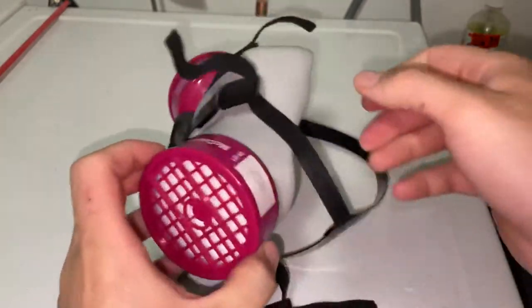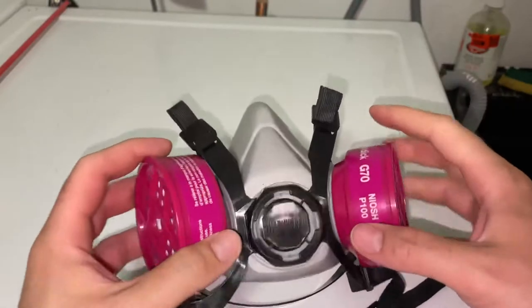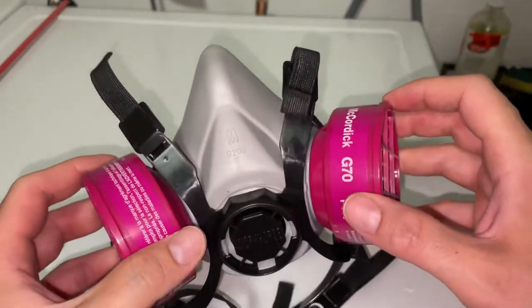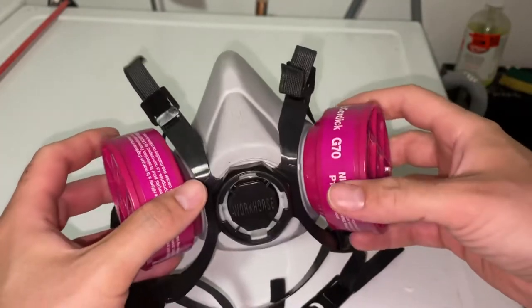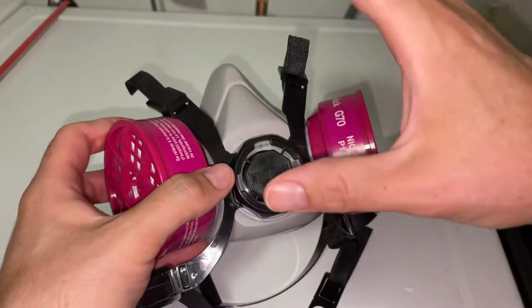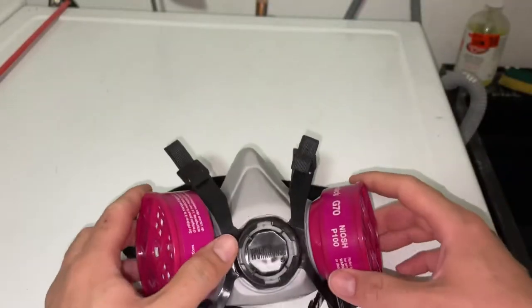That's all there is to it. The only thing you need to make sure on your end is that the cartridge is appropriate for your specific application, whether it be dust or gases, etc., and make sure that the brand of cartridge matches the brand of mask that you are using.